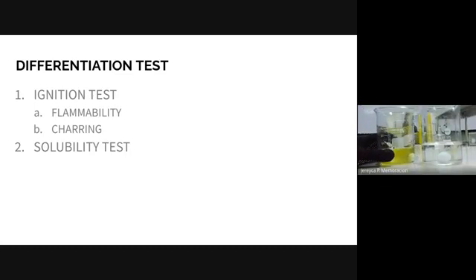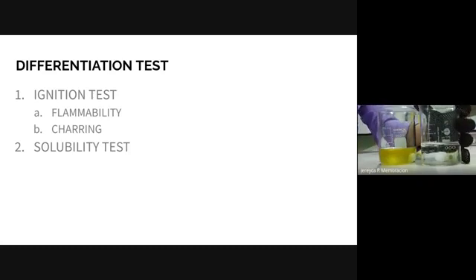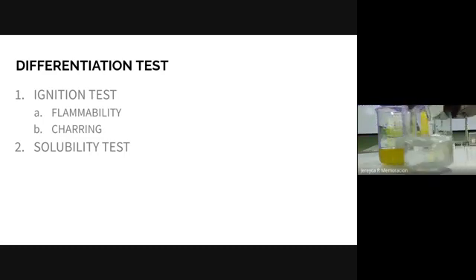So what does the direction say? You need to stir, right? Let's stir using the stirring rod. Distilled water with naphthalene. Stir and observe. It's still clear, isn't it?